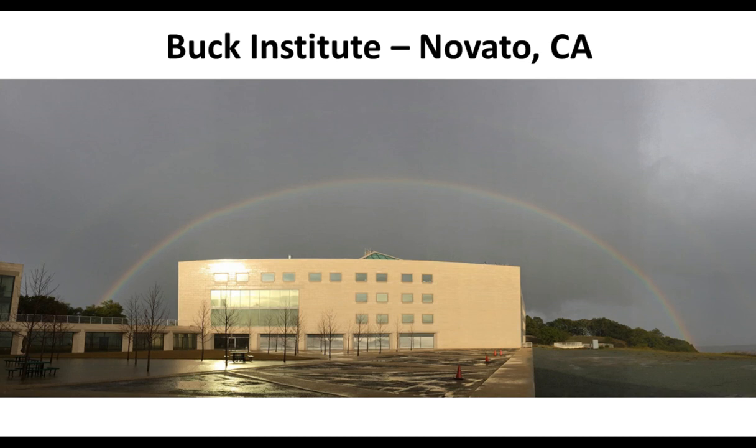Thank you. Our next question coming in: would you expect similar results using a data-dependent scan type?